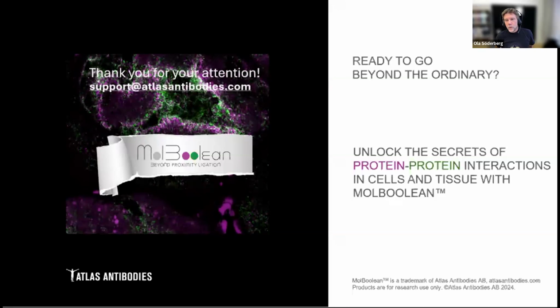What we do now is define all the different objects in the image analysis program, and then we plot them as a scatter plot, similar to what you do for flow cytometry, and try to identify objects that are single color and dual color. Then we put the information back on the image.